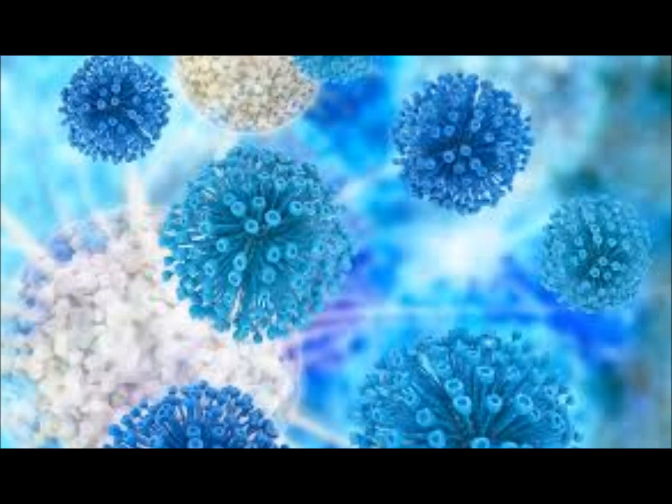On your blood agar, you'll take a loop from a clean catch with a sterile loop, and a lot of times you might make a drop right here and put a streak down it, okay? Then you'll do streaks all the way down, not touching. Some places will have you turn the plate and do streaks again. Most places will just do one set. And it varies if you use a 1 microliter, or I guess that's MCL, or a 10 microliter loop. I have 1 microliter loops.